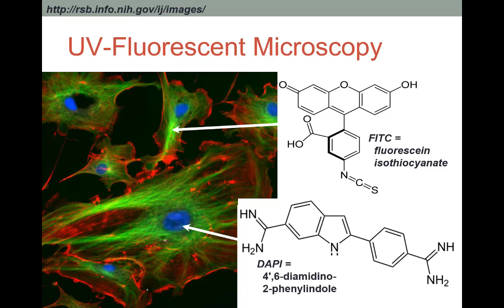And so here's a fluorescence micrograph. These colors are all false colors. The software would assign whichever color you chose, and so this one's using a blue color to indicate DAPI staining, a green color to indicate FITC staining, and a red color to indicate a third dye that was used in the sample prep. But these molecules all absorb at different wavelengths because they have different structures and different degrees of conjugation involving different atoms. And so we can visualize them all in the same sample at the same time by scanning across a wavelength range. And then using the computer here to assign some colors that make the pictures really look great in a publication.